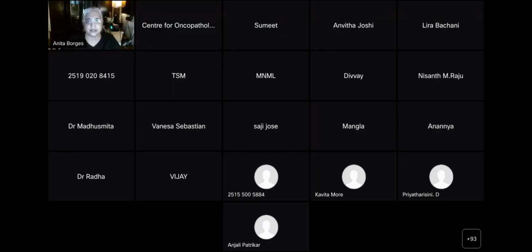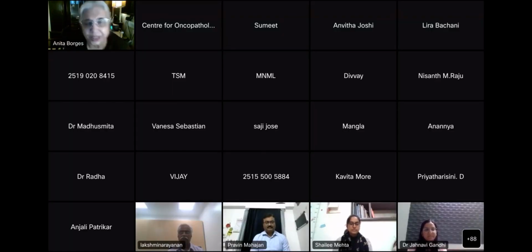So I'll stop sharing my PowerPoint, because I think that we talk loosely about artifacts, but everything that we do is essentially creating an artifact in the tissue, except that we should keep that artifact as constant as possible, so that there is no variation from one person to the next, to the third, to the fourth. And it should also not be such that in your own lab, one day you're seeing tissues that you can recognize well, and then something else pops in on the next day. So when we talk about artifacts, we must know that there is no tissue that you ever see that does not have an artifact.